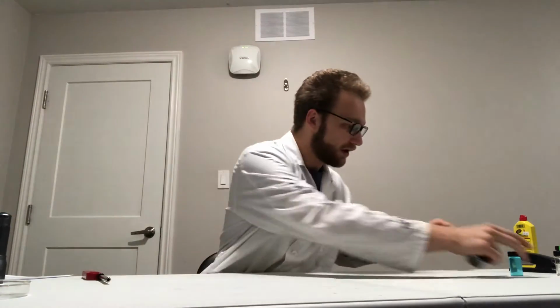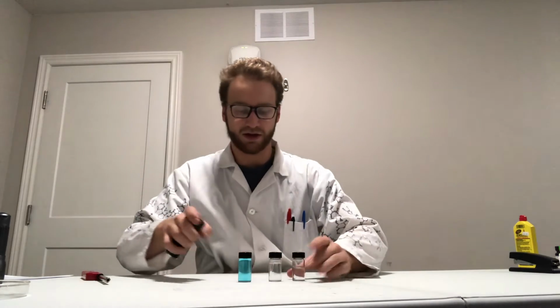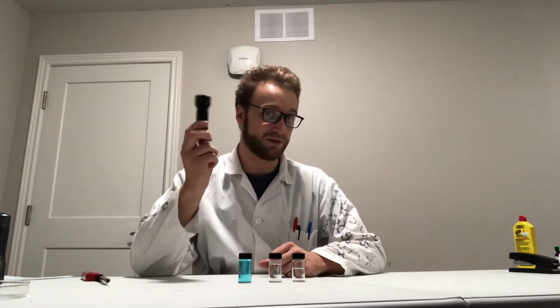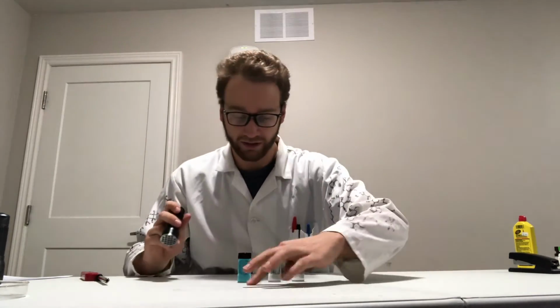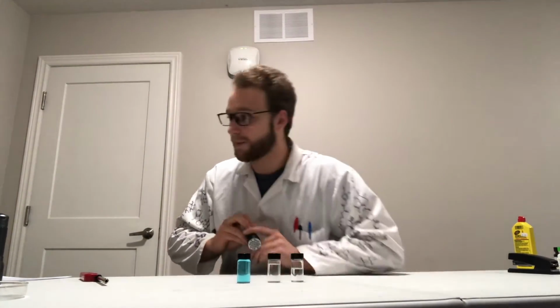So, in these three vials, I have three different substances. One of these vials contains a substance called tonic water, and tonic water is manufactured with a compound that's called quinine. And quinine is able to fluoresce under UV light, and I have myself a UV flashlight. I'm going to turn off the lights, and I'm going to shine my light, and you guys are going to see which vial contains the fluorescent compound.